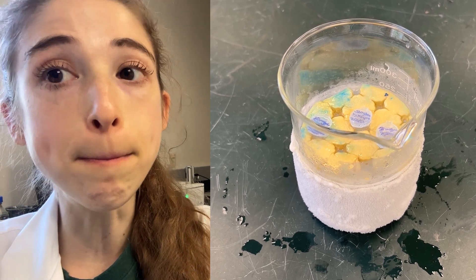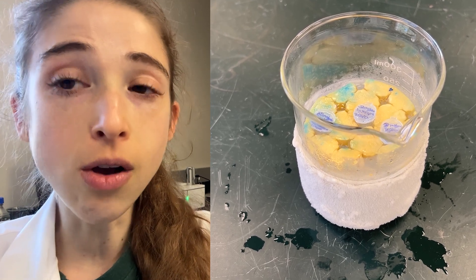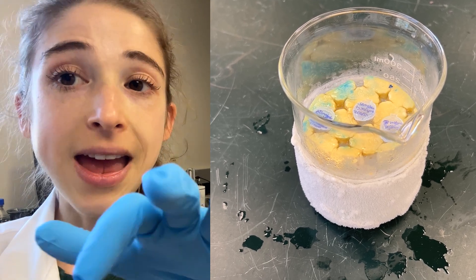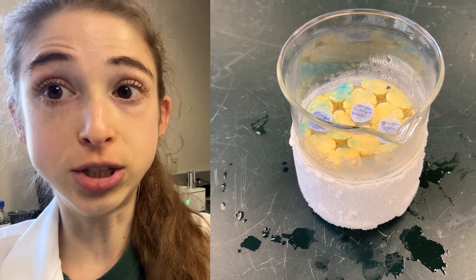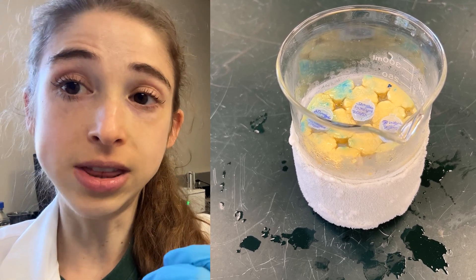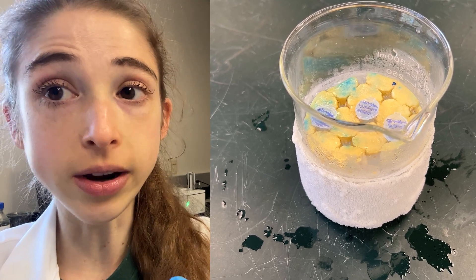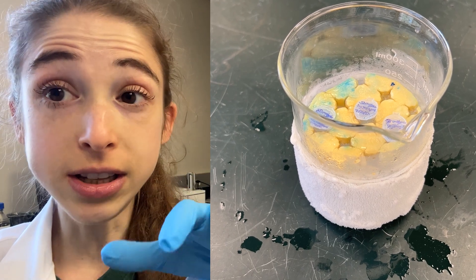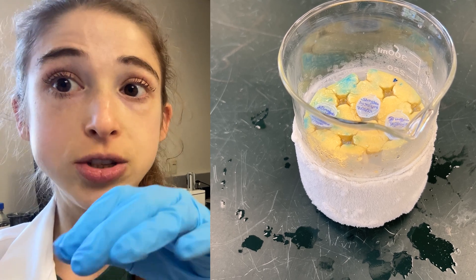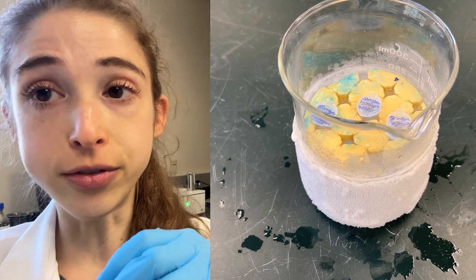You're not going to cool as quickly, but it'll still be better than just sticking it in the minus 80. The alcohols are cooled down by the dry ice until they reach the temperature just before they would freeze. This is why you get a slightly lower temperature with isopropanol than with ethanol — it has a lower freezing point. Then when you stick your sample in, the sample is hotter than the alcohol, so the alcohol draws the heat out of your sample.